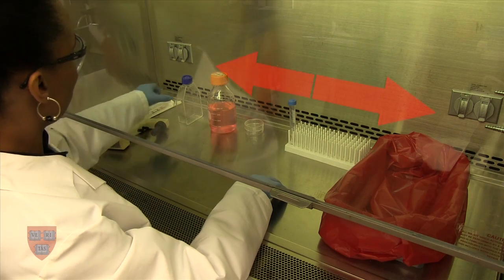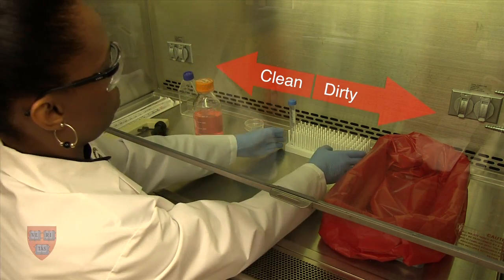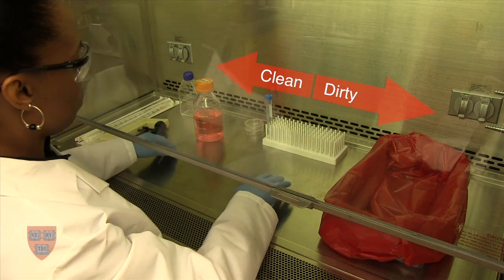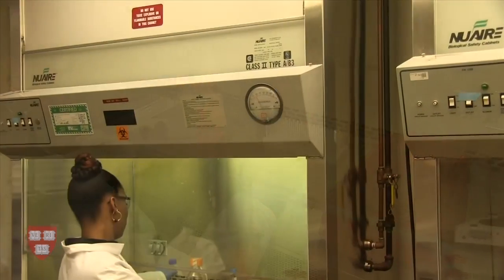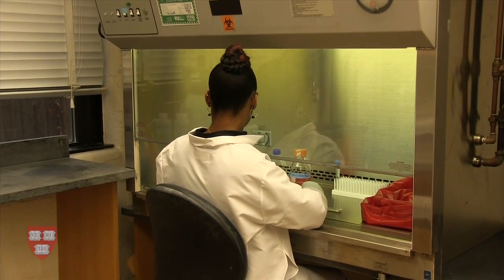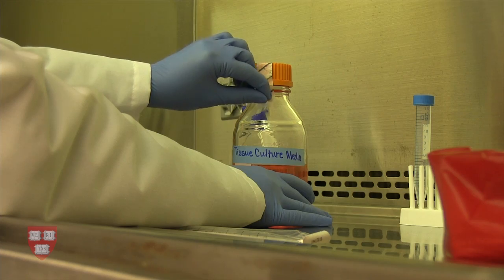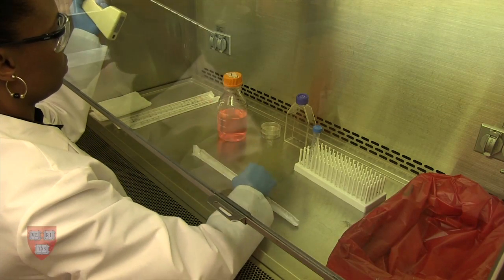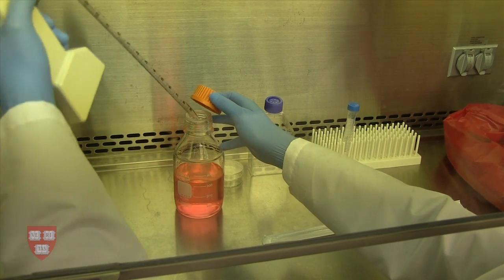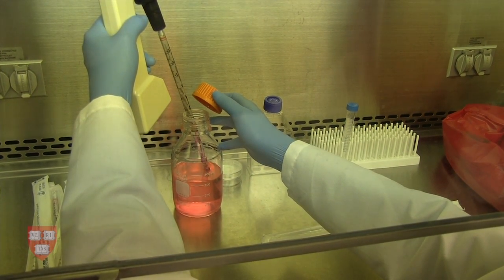Set up your workspace from clean to dirty. The goal is to not cross over clean items with potentially contaminated materials. If aseptic technique or sterile technique is needed, there are several further steps you should take. Use sterile reagents and media and work to keep them that way. When you pipette, do not allow the pipette to touch anything non-sterile. Conversely, do not allow contaminated pipettes to touch clean surfaces.